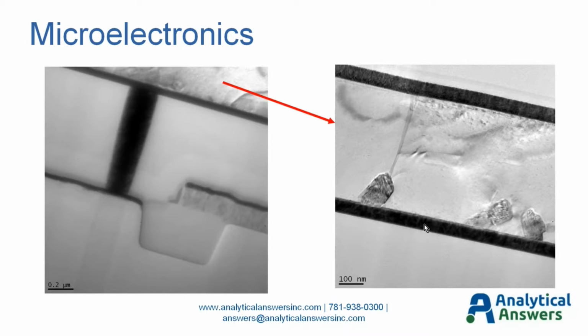We can see layers on either side of the aluminum also appear to have a polycrystalline structure, and again, since they're darker, are no doubt composed of heavier elements.